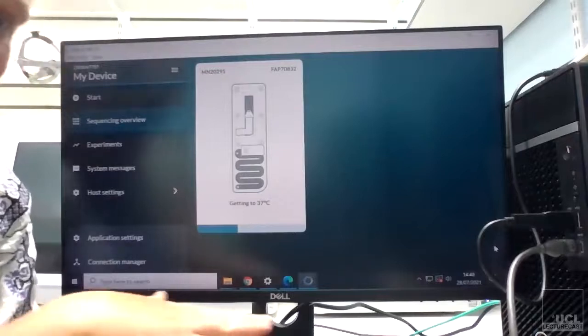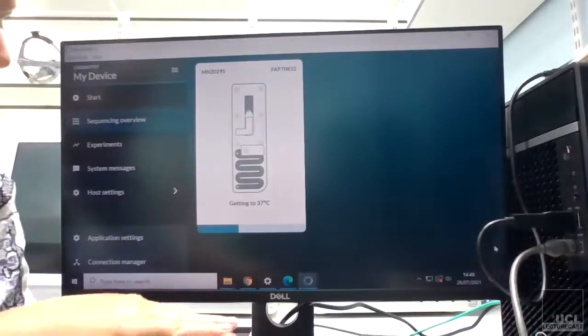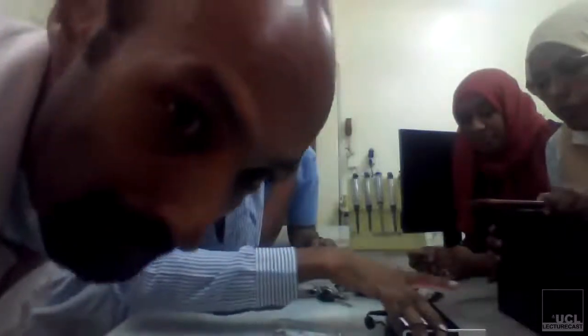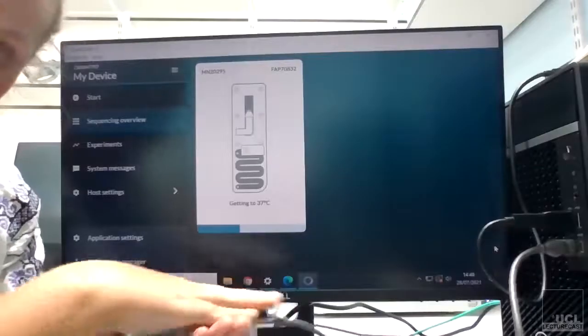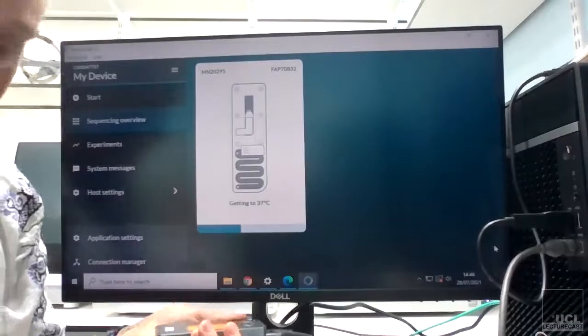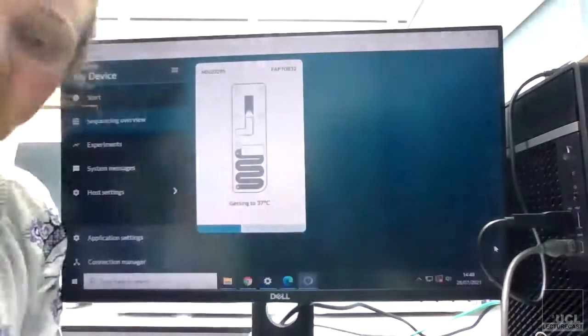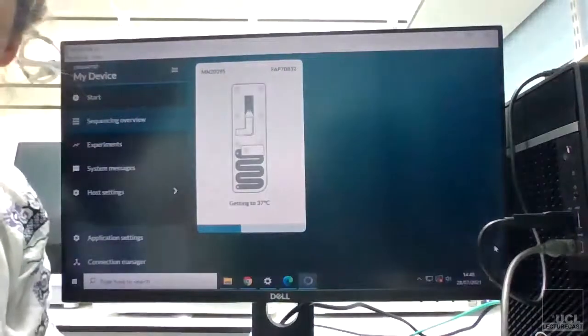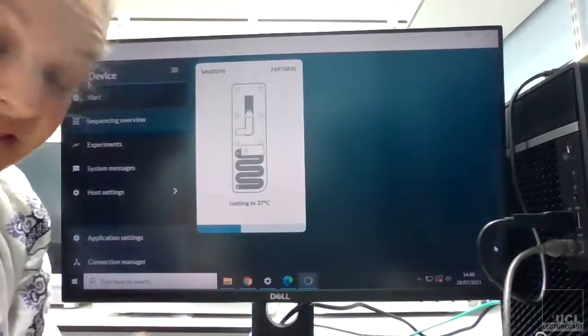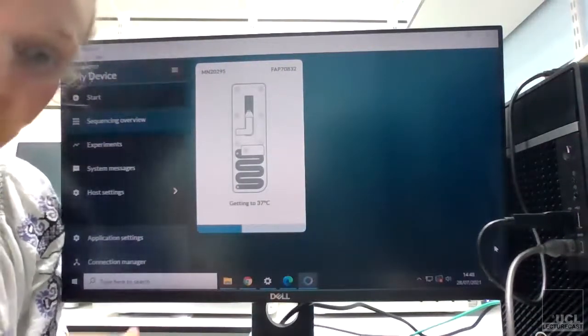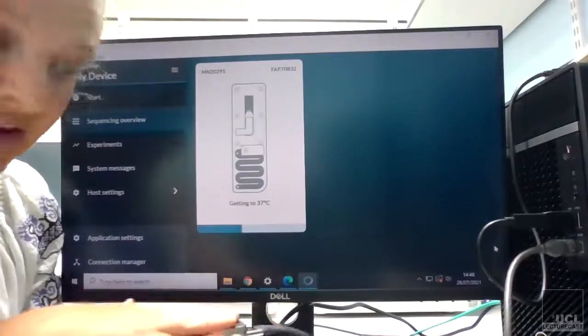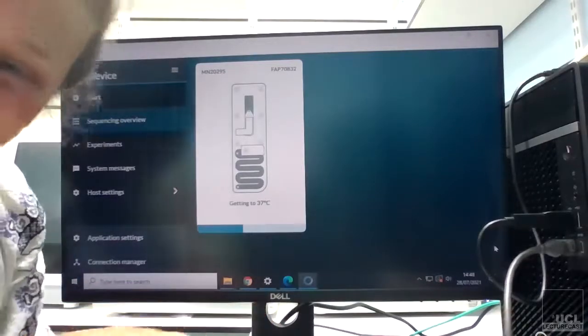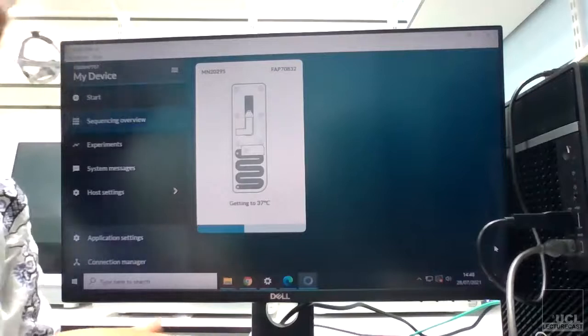You can see that the blue line is moving along the screen, and so hopefully once it's got to its temperature, this will then change to say doing QC, but yeah, it takes a little bit of time to do. You should presumably feel it warming up if you touch, especially the bottom, it warms up.